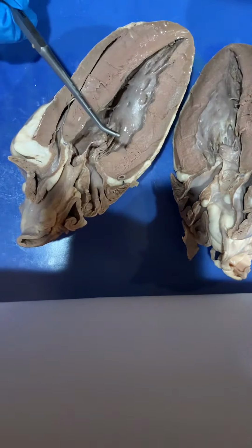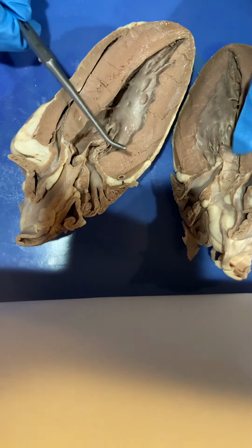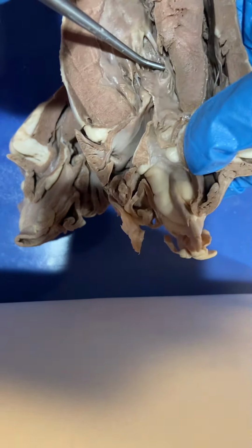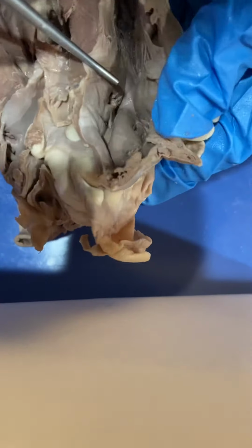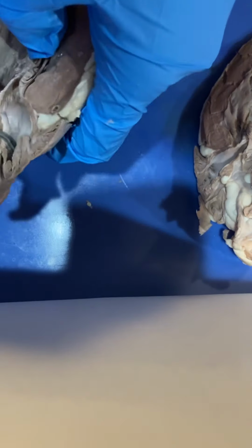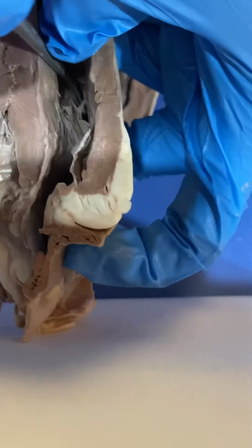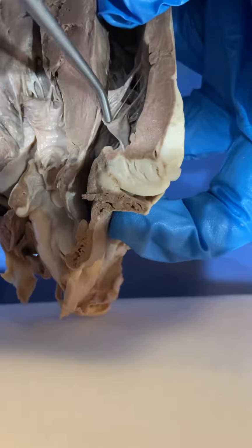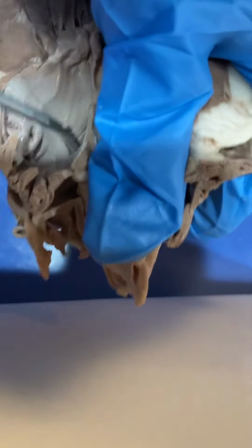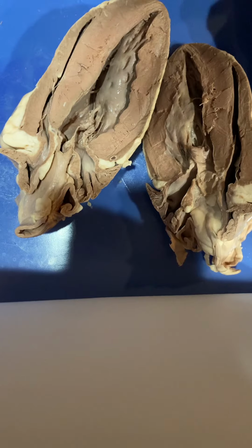Another key feature of the heart is going to be the auricle, and these are going to be flaps that are made up of muscle inside of the atria. So here, you'll see some flaps here. You can kind of see, it might be a little easier on this one, such as right there, you can see that flap, different flaps, and then going through. And this is a brief overview of the dissection of a sheep heart.